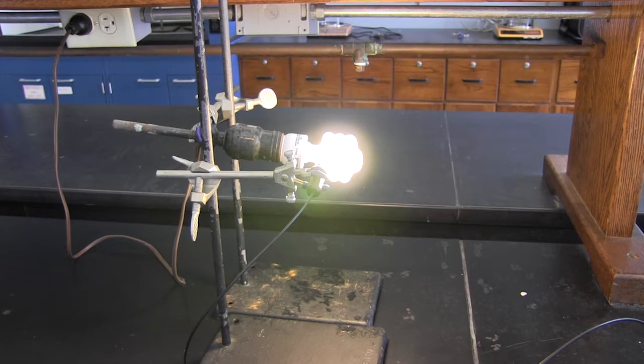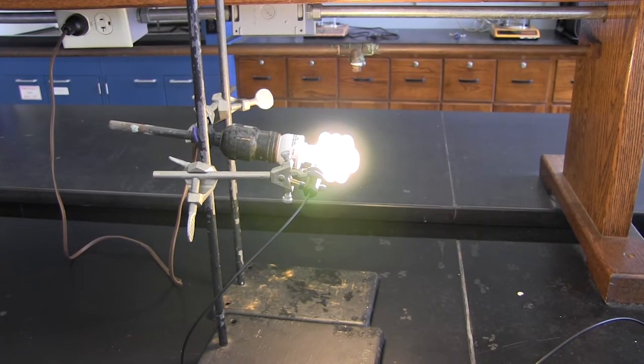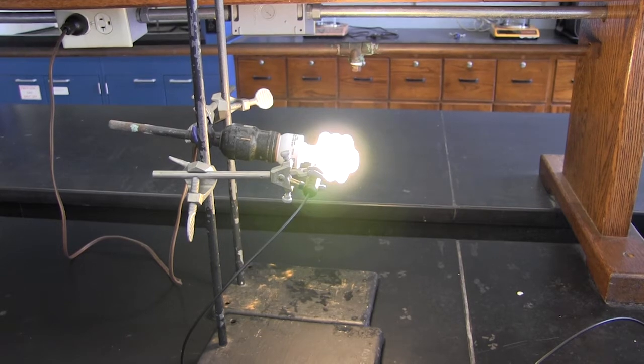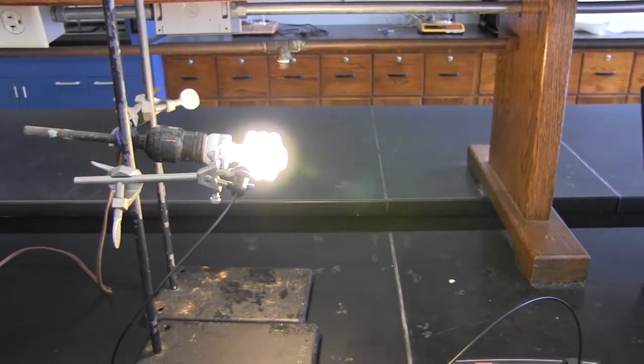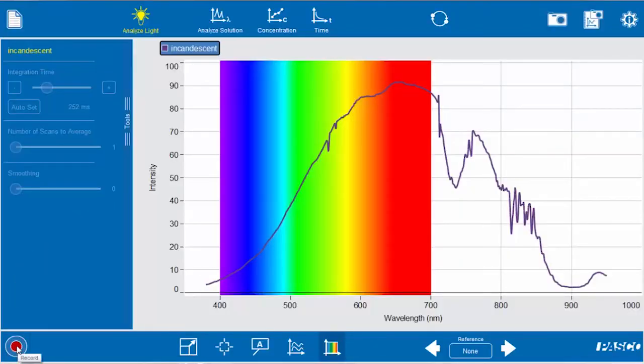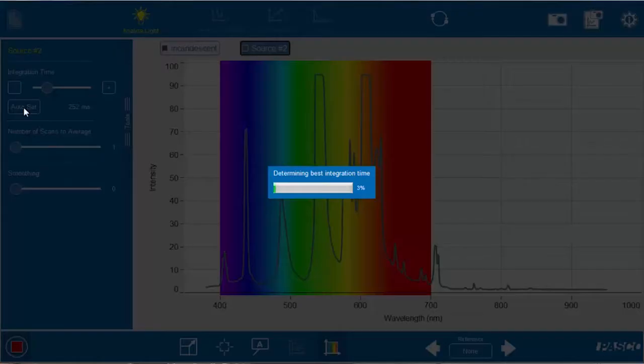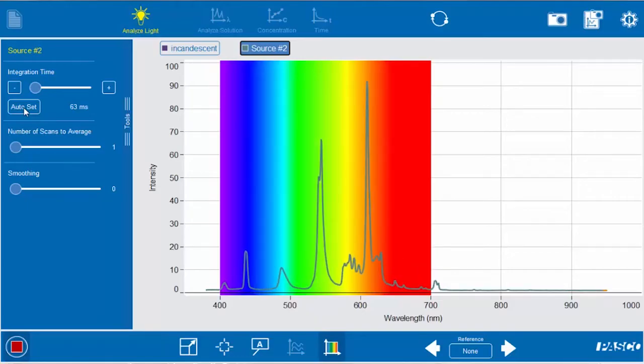So now we've switched light bulbs and changed over to a compact fluorescent light bulb, the newer style light bulbs that are in homes, and we want to look at what its spectrum looks like. So again you just press the play button in the bottom left-hand corner of your screen and the integration time is too high, so we're going to auto set the integration time and there you see the spectrum for the compact fluorescent bulb.